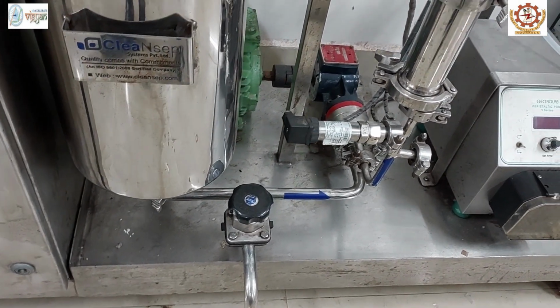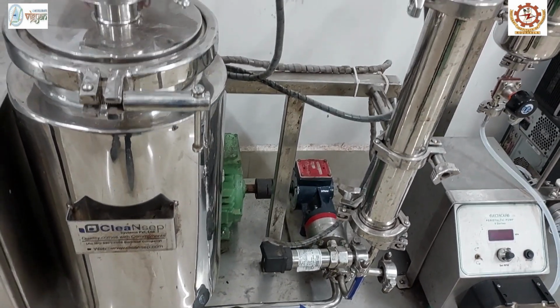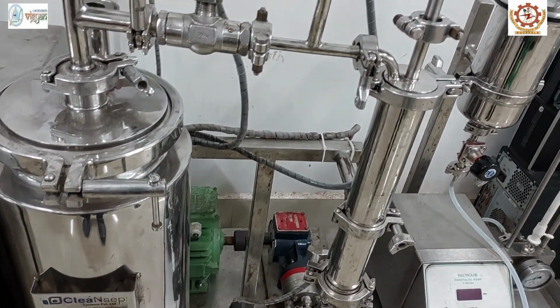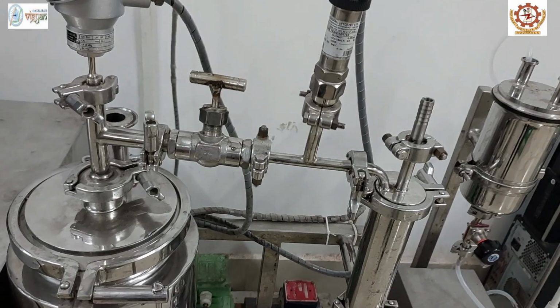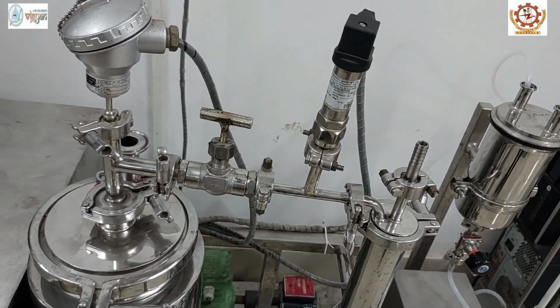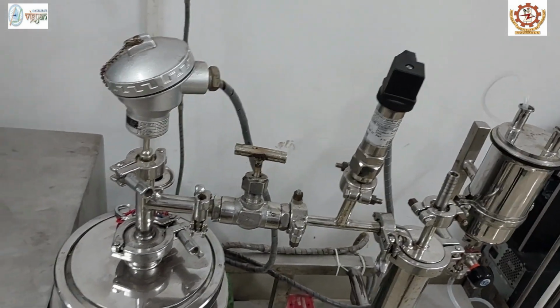Nanofiltration removes components with a small molecular weight, for example, amino acids, sugars, divalent ions, and all microorganisms. However, it allows the passing of certain monovalent ions such as sodium chloride along with water through the membrane.